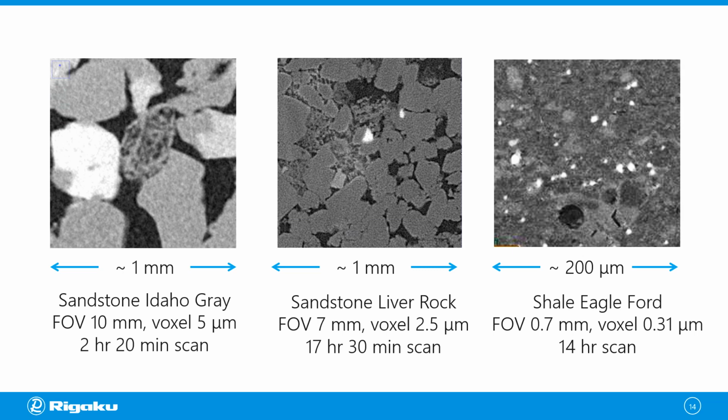So this goes to show you that for most of the sandstones, you can use high resolution micro CT scans. But if you want to analyze shale, you might want to use SEM instead of CT.